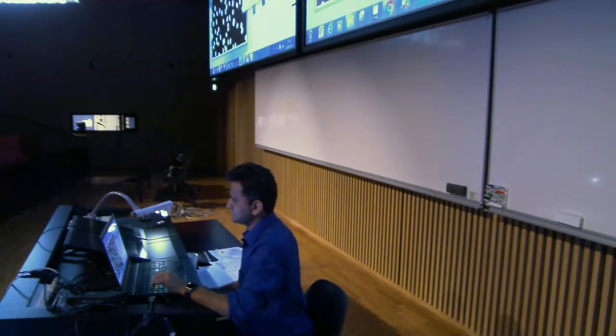so I'll just zoom out a little bit. Maybe I'm not interested in the nuclei which are at the boundary, because they are incomplete. So I go to analyze particles, and here maybe I do not want nuclei which are of very small size. Let's say here they're very small. So maybe I want the nuclei which are of size 100.